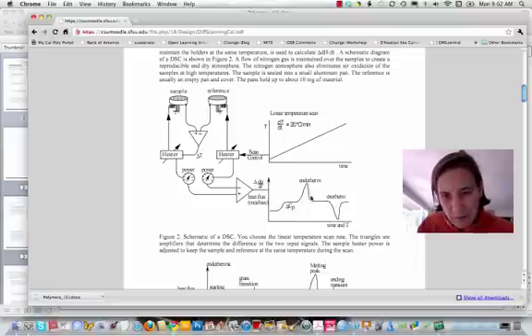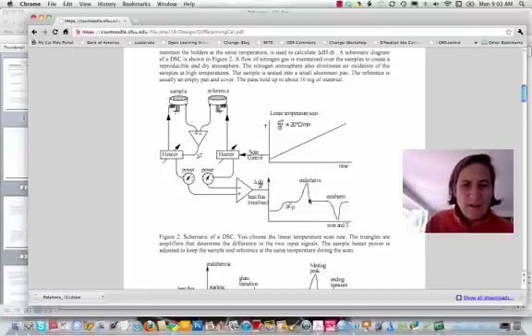And then right here, this feature indicates that there's a lot more heat required in order to keep the temperature of the sample the same. So in other words, the sample is actually absorbing heat in order to keep the temperature equivalent to the reference. So this is an indication of an endothermic event, and this one right here, where less heat flux is required relative to the sample, is an indication of an exothermic event. So these are idealized versions of the output from DSC.